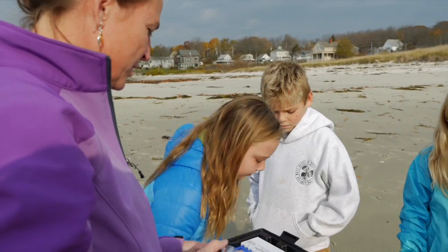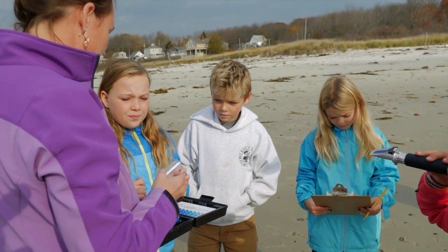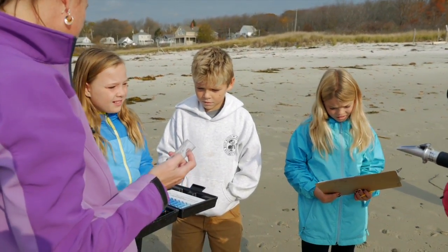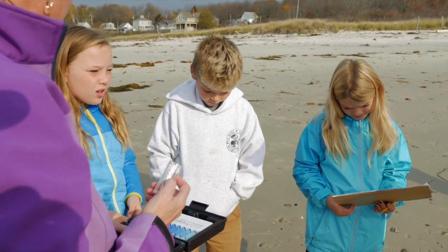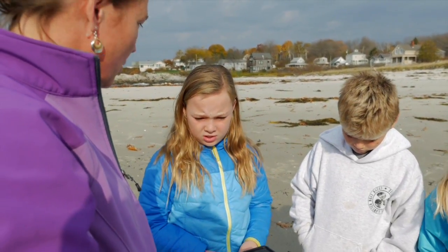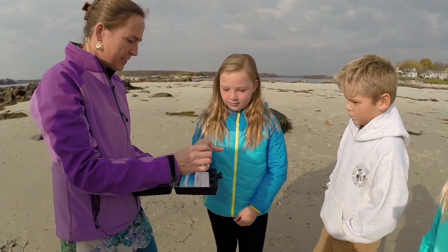So now we're going to do dissolved oxygen, and Aggie, you're going to do this today, and what does this tell us? How much oxygen's in the water? Yeah, what is that? Who cares? Because some creatures and animals need oxygen and some don't. They don't need as much? Yeah. So the oxygen levels might be different in different places. Can you fill it up to the 10?